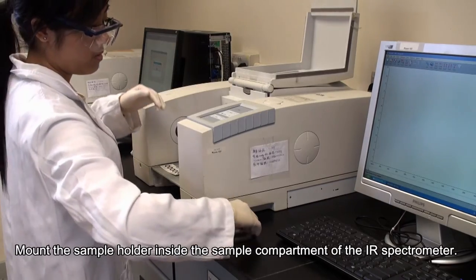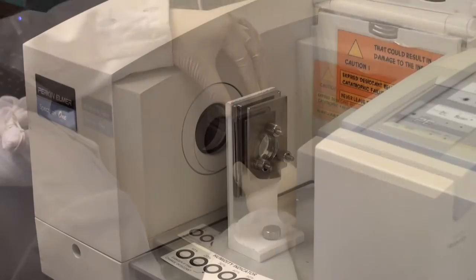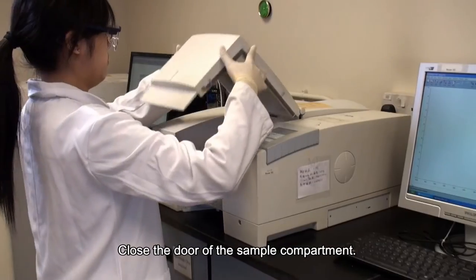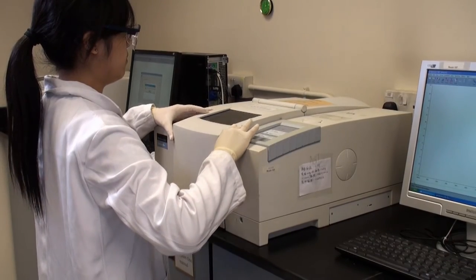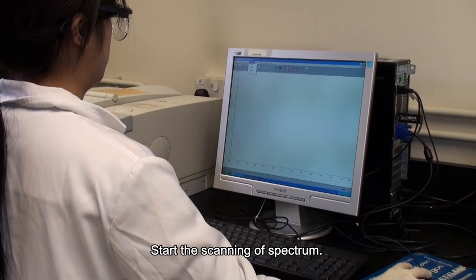Mount the sample holder inside the sample compartment of the IR spectrometer. Close the door of the sample compartment. Start the scanning of the spectrum.